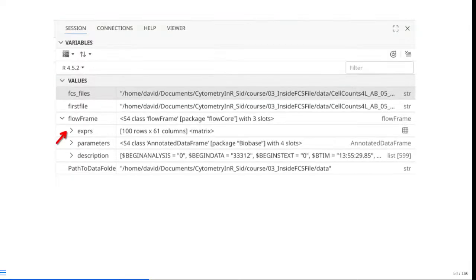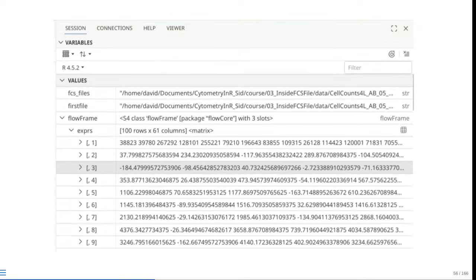All right, so at this point, we are taking our attention a little bit back to that right secondary sidebar. We kind of already perused this little matrix option when we clicked on it, but there's still a little drop-down menu, so we're trying to be a little thorough. Let's go ahead and click and see what happens. And in this case, what we see is it quickly drops down another 61 set of lines, and it's not particularly user-friendly or visually friendly at first glance.